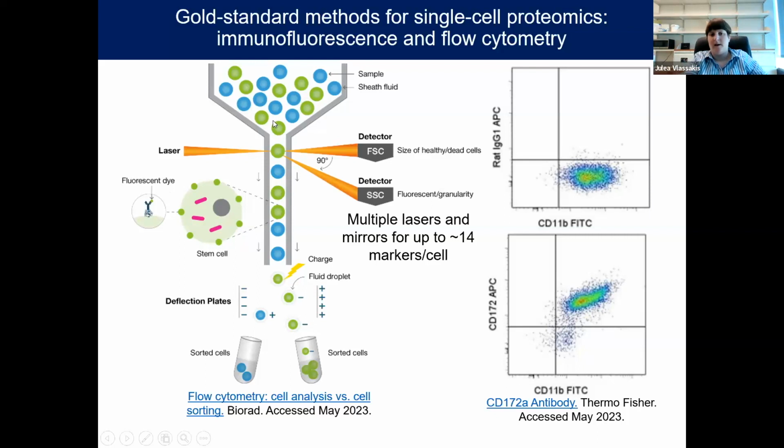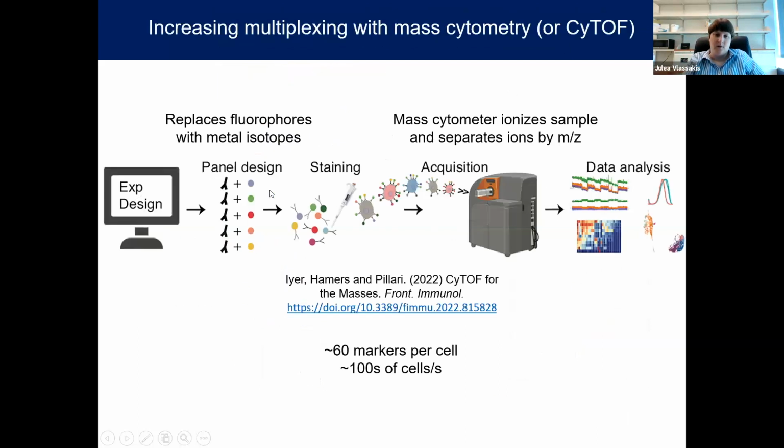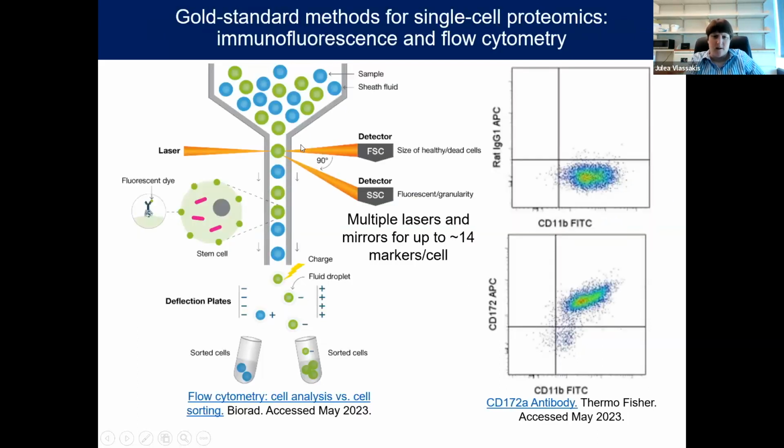The cells in this case are passed through the flow cytometry fluidics, which narrow down to sort of single file cells passing through this channel here, where a laser excites the fluorescence, and then two different detectors record parameters related to size, although not directly correlated, and in many cases poorly correlated. So be careful with that parameter. But also the fluorescent signal of the sample.